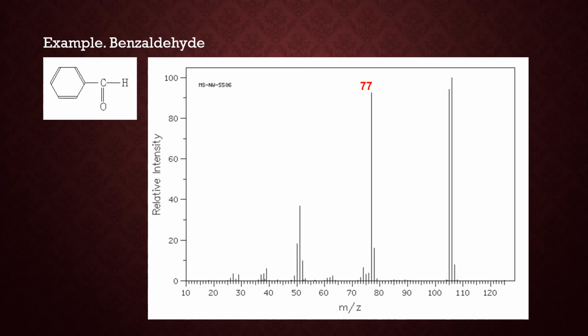And this is your typical signature. When you have a substituted benzene and the substituent gets torn off during the fragmentation process, a characteristic signature peak at 77 appears, indicative of the benzene ring ion.